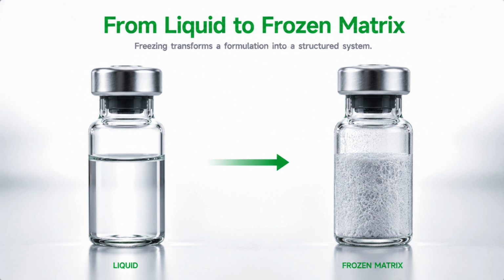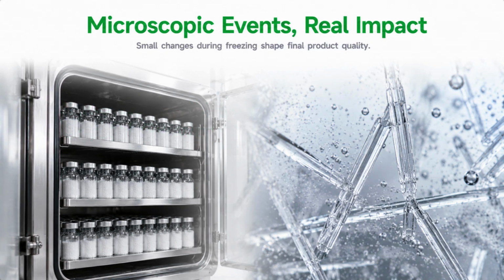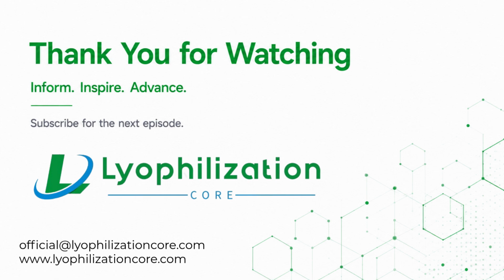In this episode, we explored how freezing transforms a liquid formulation into a structured frozen matrix. In the next episode, we'll examine ice nucleation and ice crystal growth in greater detail and discover how microscopic events during freezing can determine the efficiency and quality of the entire lyophilization process.